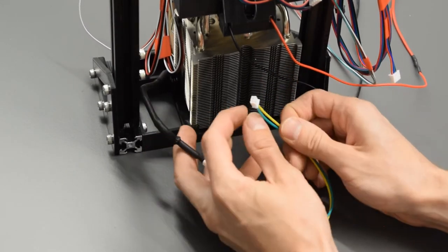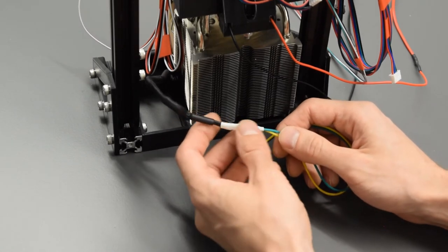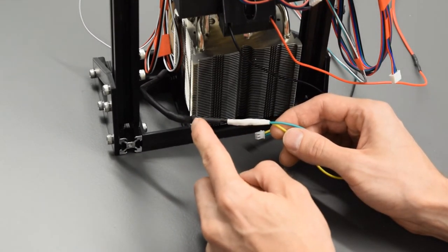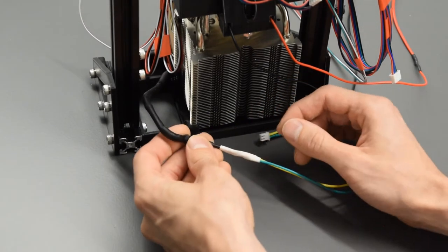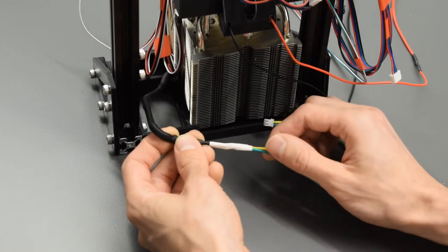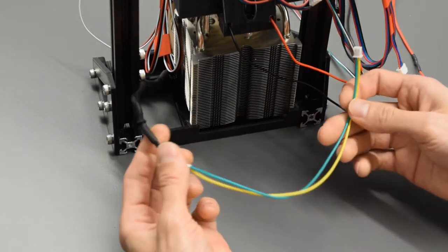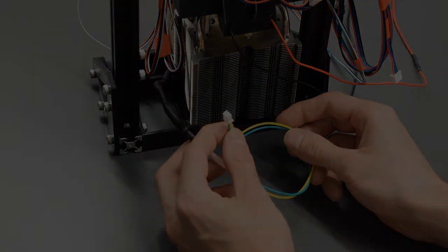So I first crimped 2 terminals on there. I put it in the 2-pin connector to make sure I could get that on there correctly. Then I inserted these wires into 2 pieces of heat shrink tubing. There's 1 medium piece as well as 1 smaller piece. Then I stripped about 1 centimeter off the end of these 2 wires as well as the green and yellow from the fan. And then I twisted, say for the yellow wire, the 2 yellow wires together, and there was that small piece of heat shrink tubing on that already. I covered the connection of the solder joint of those 2 wires. Then I made the second solder connection between the 2 green wires, and I put the medium piece of heat shrink tubing over all of it. So there are 4 wires in there, only 2 are used, and they extend by about 8 inches to the 2-pin female JST-XH connector.